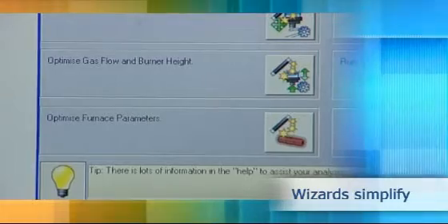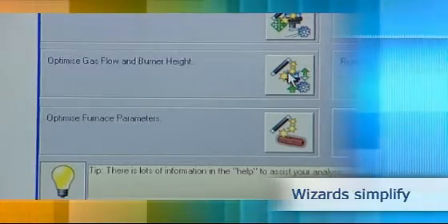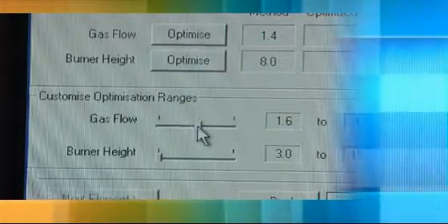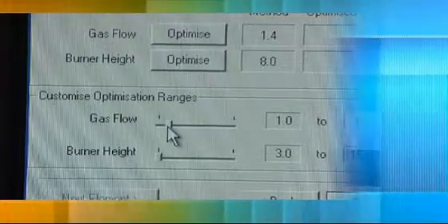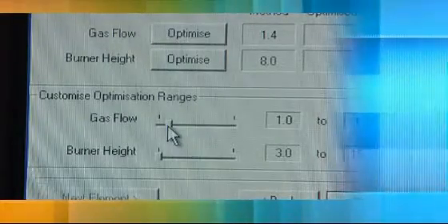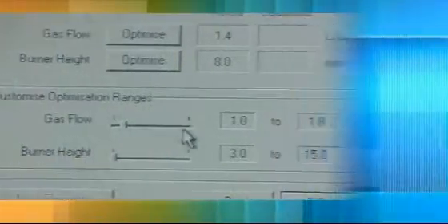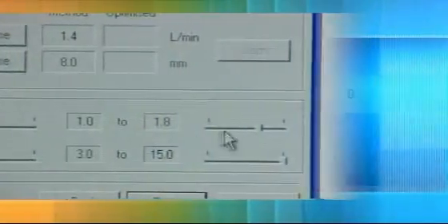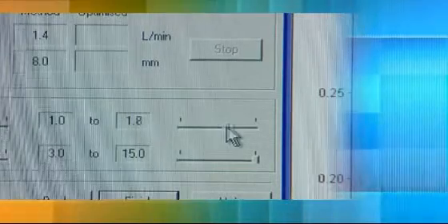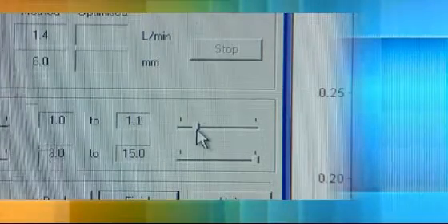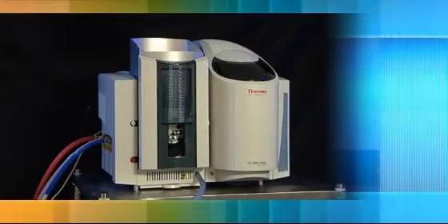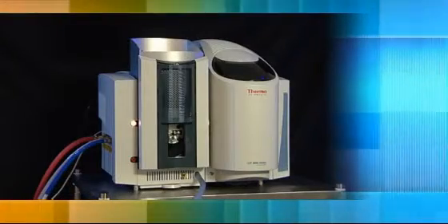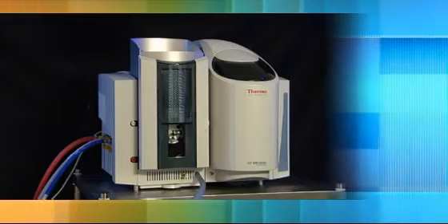The Optimize Gas Flow and Burner Height wizard leads you through the steps required to get the best performance for your analysis. The wizard's step-by-step approach ensures that the optimisation is correct first time. This makes it easy for new users to get the best results for their analysis and saves valuable time.